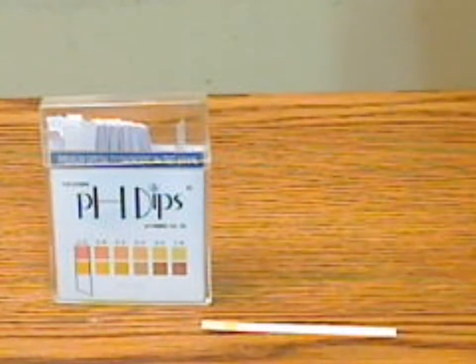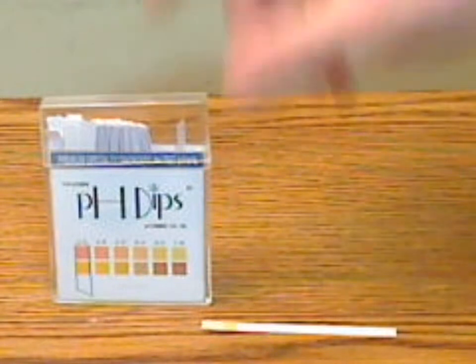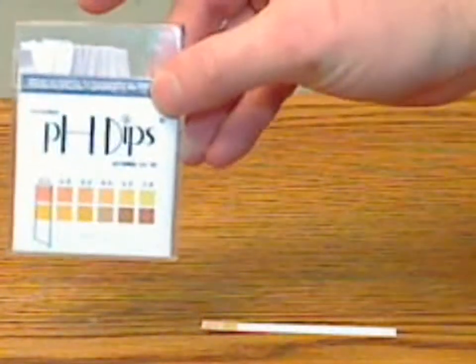These are the Cruzeco Specialty pH testing strips. Similar to the Universal, they come in a plastic case of 100.